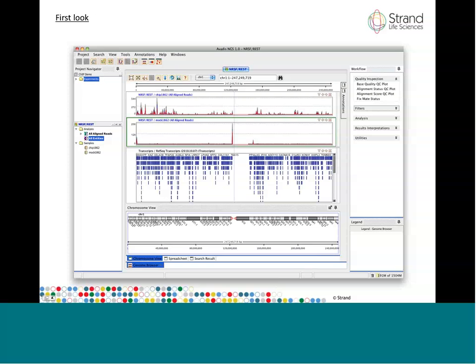But as you continue to do your work, the new results like read lists, region lists, gene lists, clustering trees, pathways, all of those will be created in the navigator in a logical manner. And the hierarchy contains the audit trail of those results, placing, say, a gene list obtained using a particular read list as an input as a child of that particular read list. Each time you run a particular operation from the workflow, you will need to specify one or more objects from this navigator as inputs. The result of the operation will be added back to the navigator at the appropriate place.